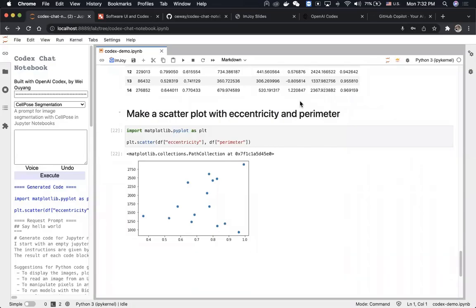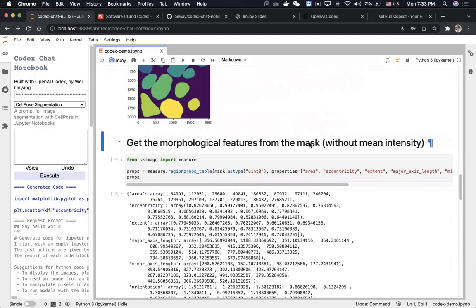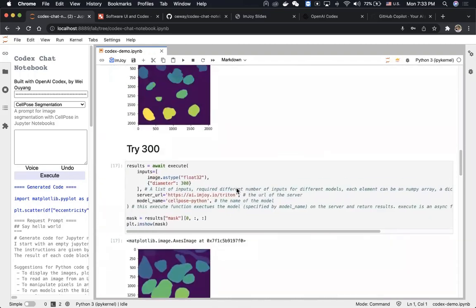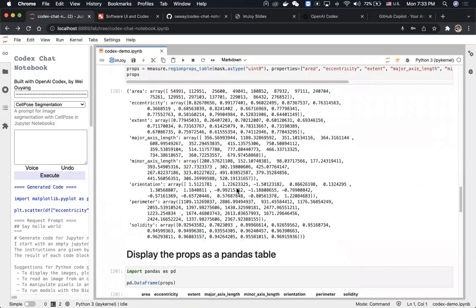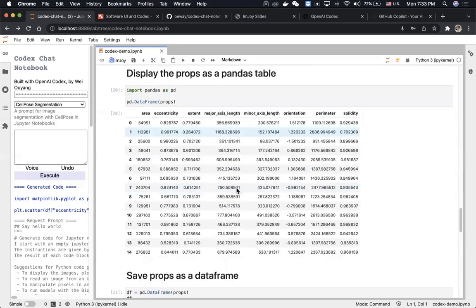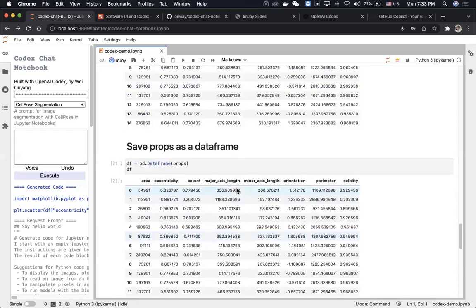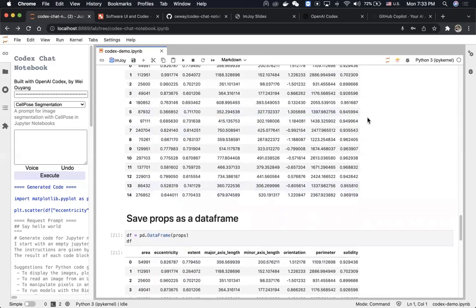So that's it for the demo. As you can see, I did not type any of the code — only English instructions. Although sometimes I need to give another instruction with a more accurate description, in most cases it gives you what you want. I think the implication is huge for the future. It can either reduce or completely remove the requirement of programming, hopefully with the next generation of Codex. In the meantime, it can also help programmers and data scientists improve their efficiency, because you don't need to go to Stack Overflow as frequently.